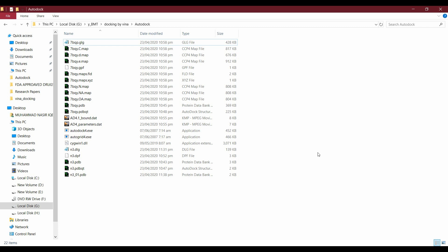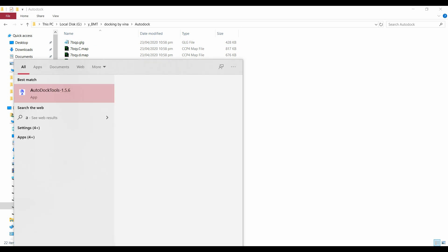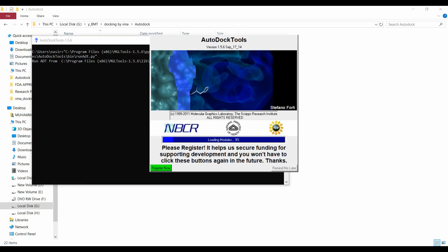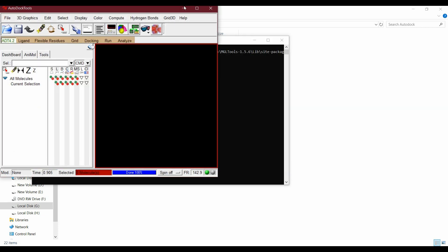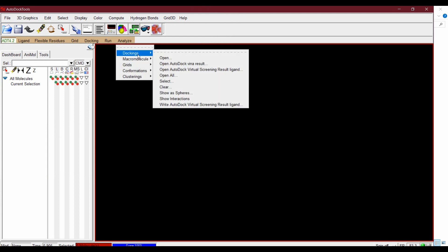In this video we will talk about AutoDock result analysis. After docking with AutoDock, we will have a file with the .dlg extension. Let's start the analysis of the results — open AutoDock Tools, then go to Analyze > Docking and open the .dlg file.